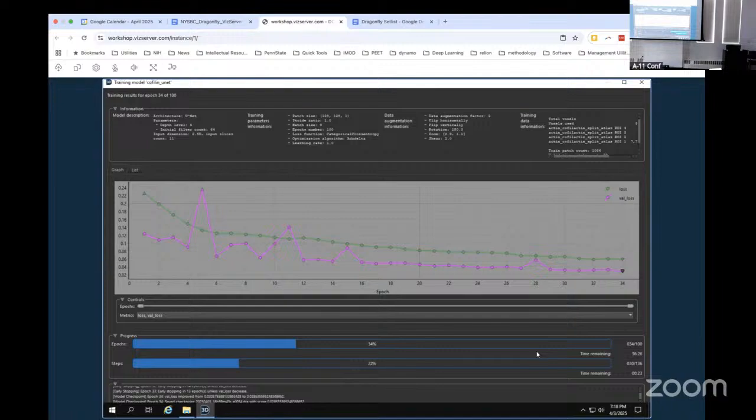Okay, yeah. Trying to detect surfaces is a big thing, but fundamentally it might be detecting the field which you use. I have tried to use statistics, but it would be very low in your case.